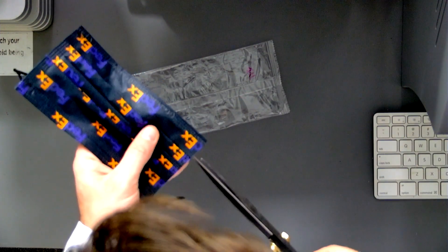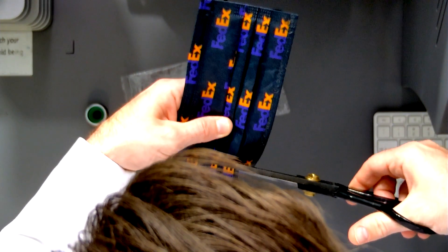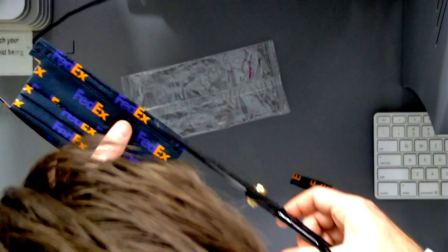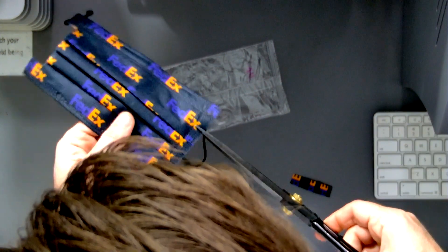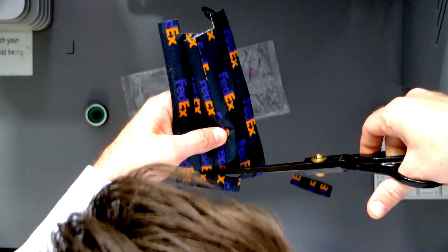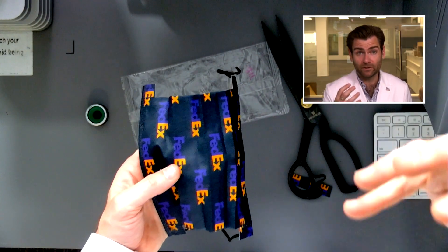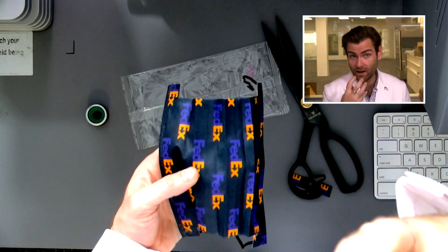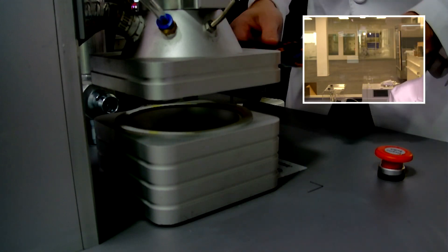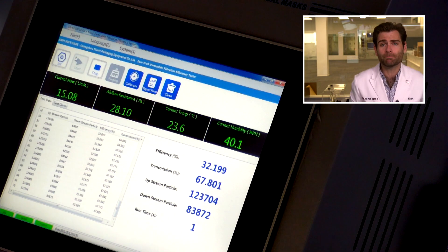Now I've got to open this up because when we test the fabric we're basically testing the fabric as a filter. I'm gonna open it up and take off the part of the mask that's folded over. A mask is actually a square piece of fabric — when you open it up it's a giant square. The reason they do that is for breathability: the more fabric you have, the bigger the filter you breathe through, the more breathable it is. Let's let her rip — this is a PFE machine, a Particulate Filtration Efficiency machine.